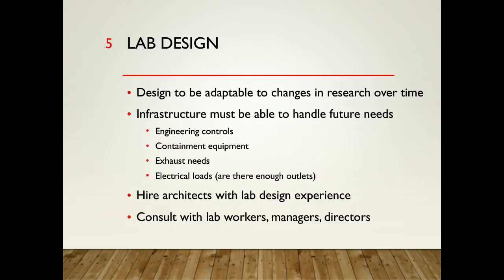And the final thing as far as lab design is make sure that you're consulting with the lab workers, managers, and directors that are involved in that space. Those people on the ground have good insight, and they need to be included in the discussions about how to design the space. They're the ones doing the day-to-day work, and they need to be included because they're going to be the ones using the space after it's done.